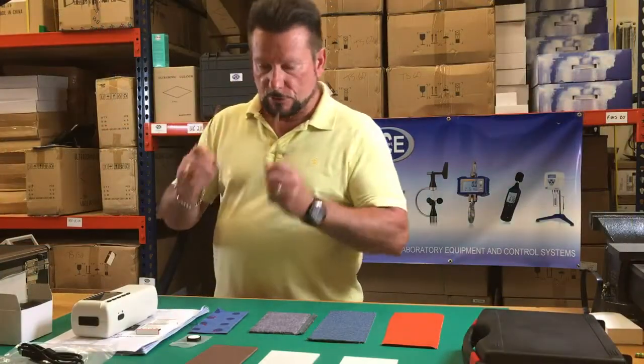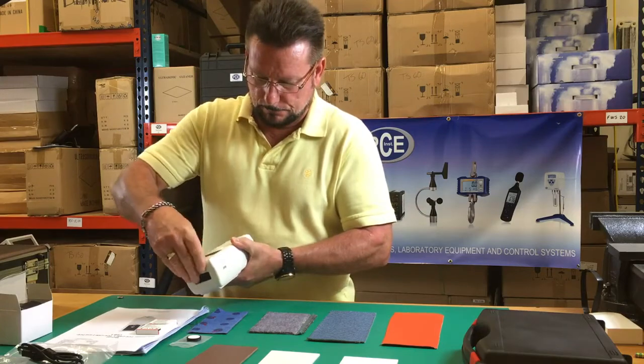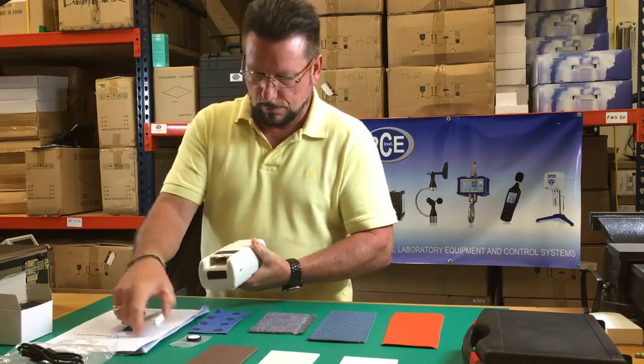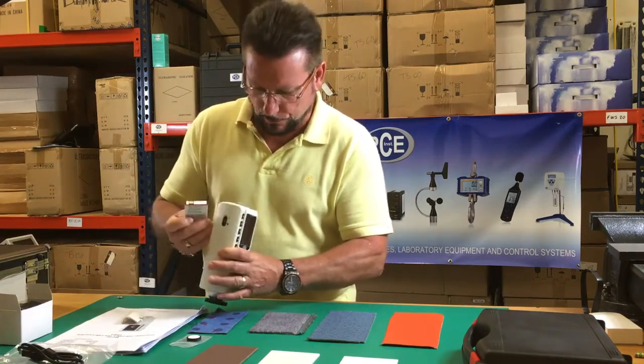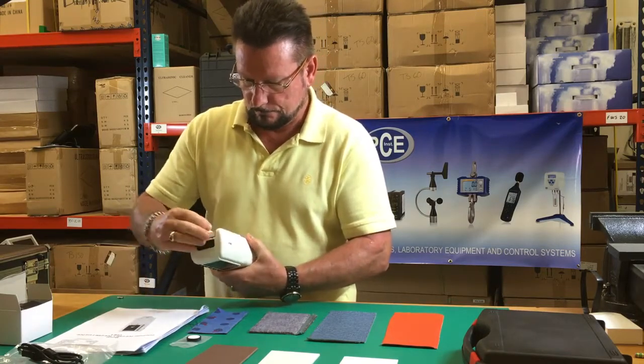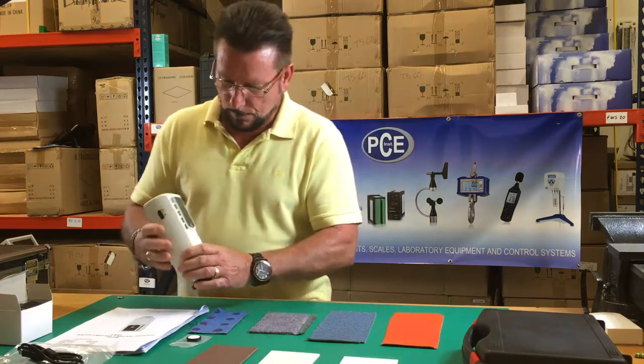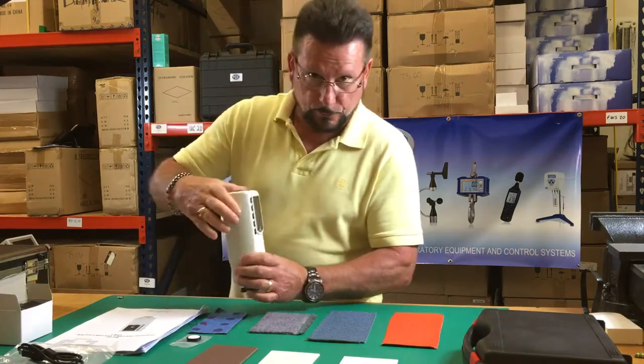Now we're going to install the battery. Take the back off. Install the battery with the connections pointing toward the connections inside. Turn it on with the on and off switch.